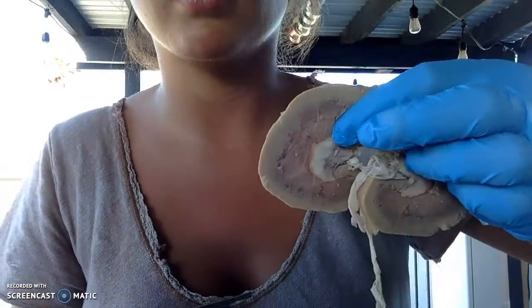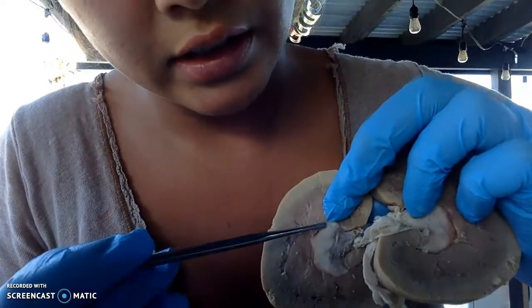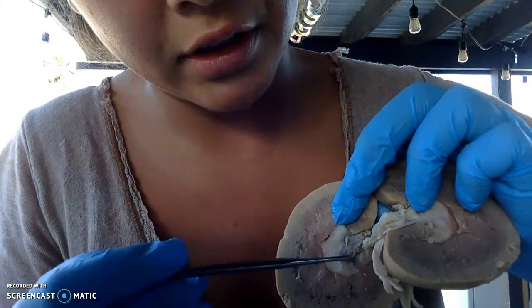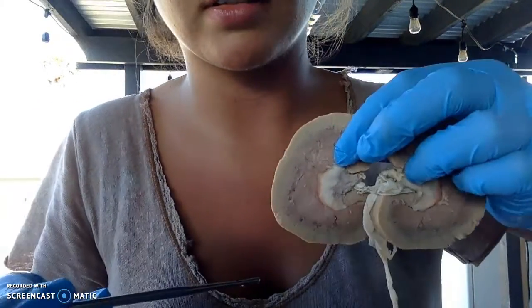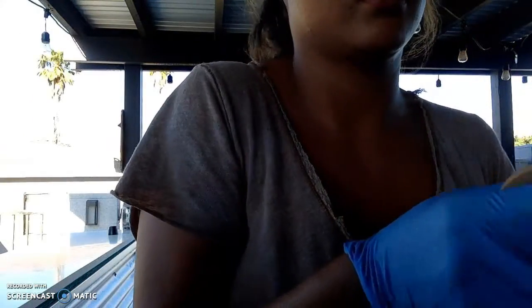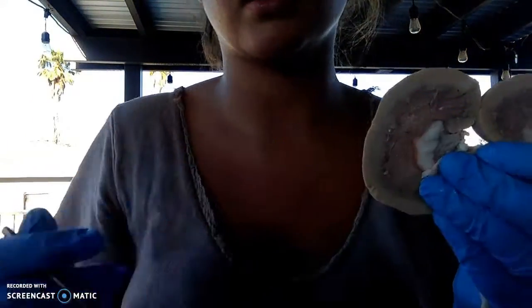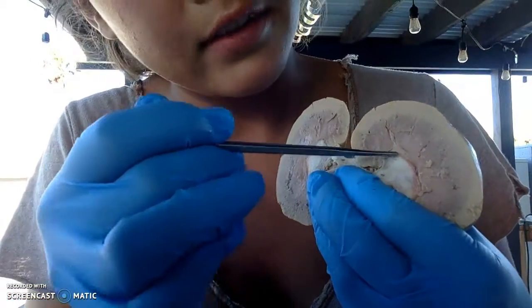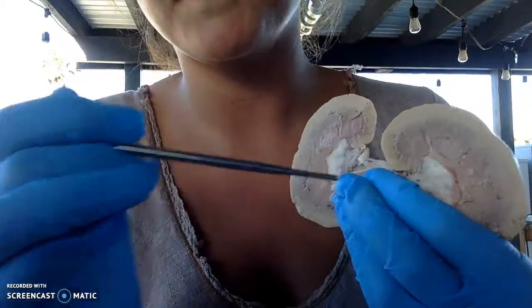And then the renal pelvis is this white matter that's in between here. So the renal pelvis on this side, and the renal pelvis on this side as well. It's this white matter that's right here.